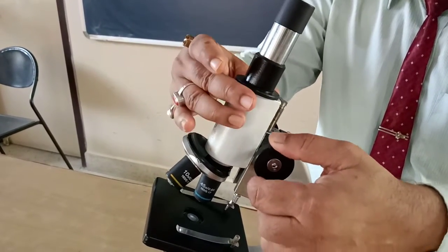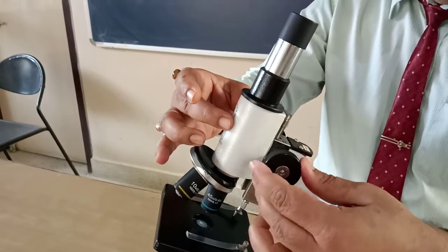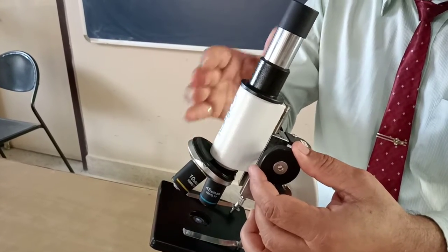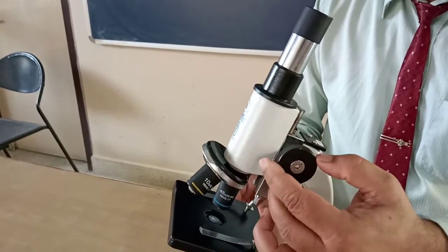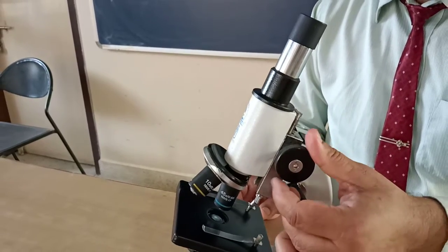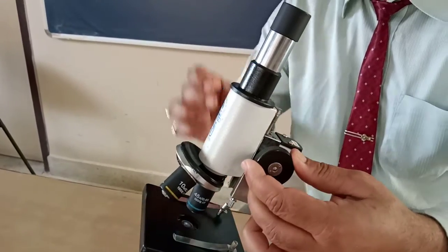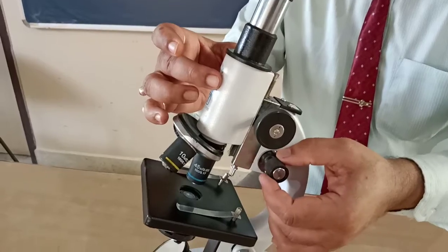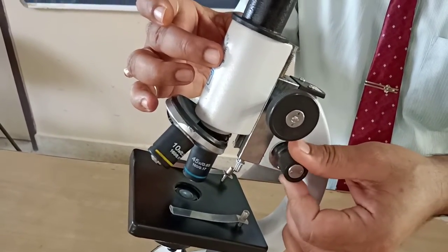The body is having the tube, so it moves downward or upward. We can move it for adjustment. If you want to set the slide, or adjust the lens on the slide, we have to move this as per the situation. So this is the broad or coarse adjustment screw. This moves the body tube rapidly, and this smaller one lying below it is the fine adjustment screw.